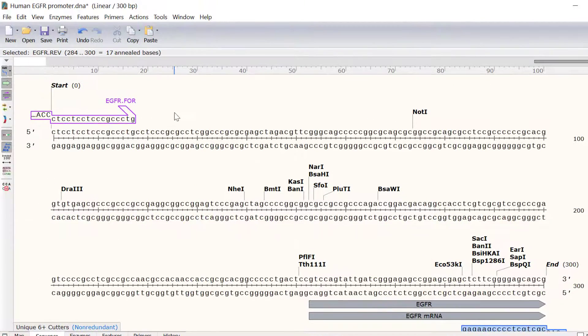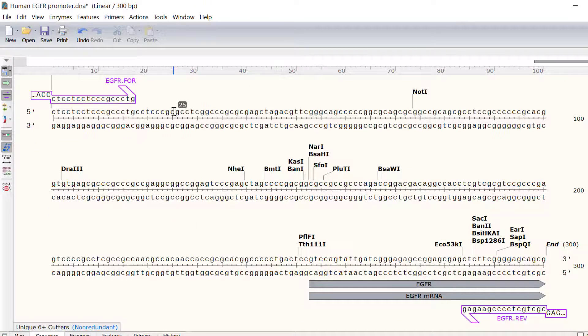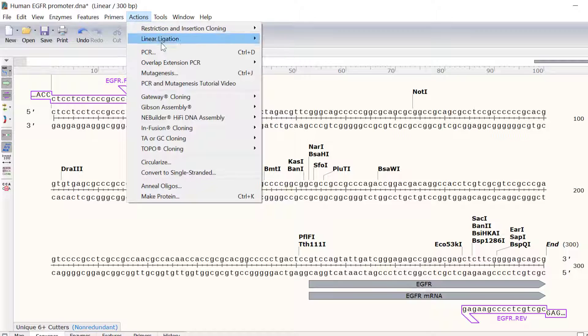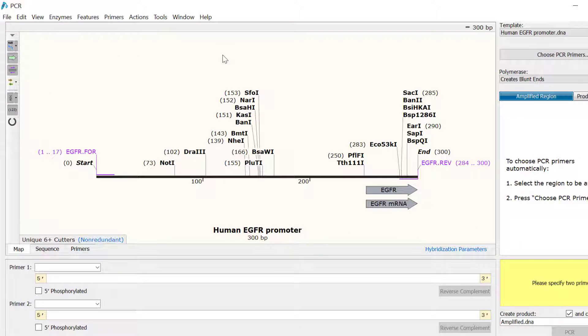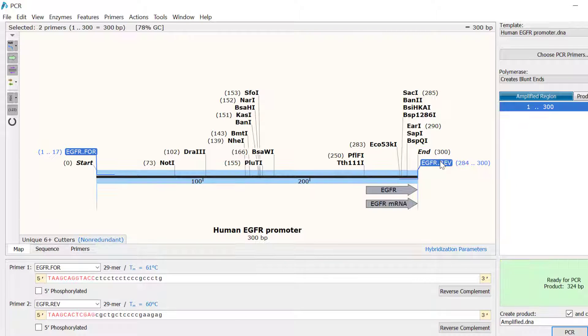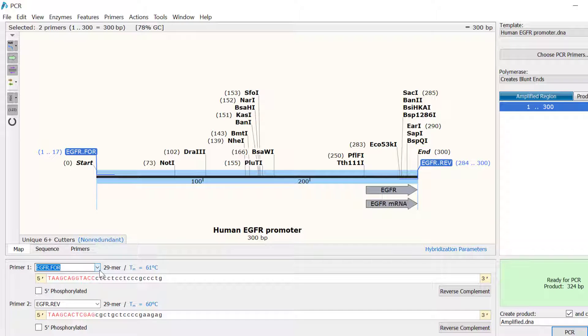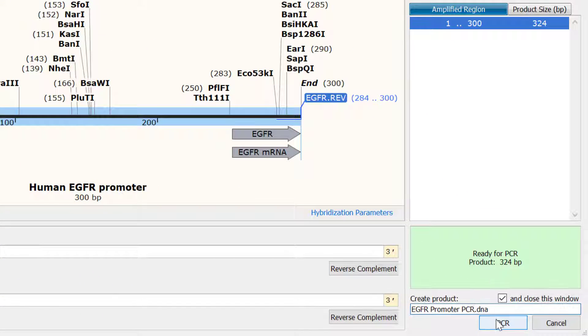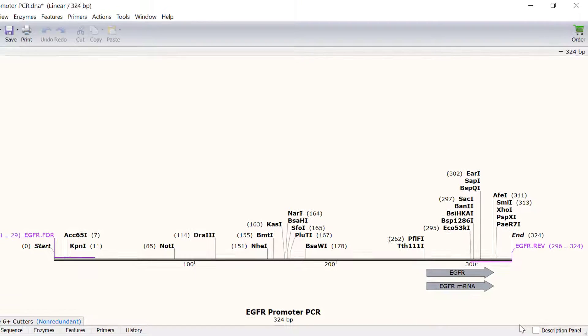Now with the primers designed I can simulate the PCR by going to Actions, PCR. To specify the primers for PCR I can either click on the first primer in the main window and then shift click on the second primer, or I can use the drop down menus at the bottom of the window. With both primers selected I will rename the file egfr promoter PCR and click the PCR button to simulate the reaction.